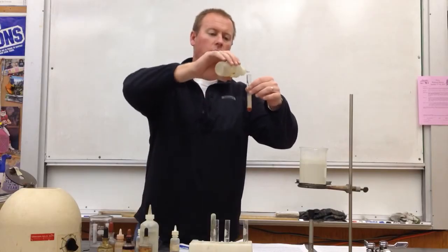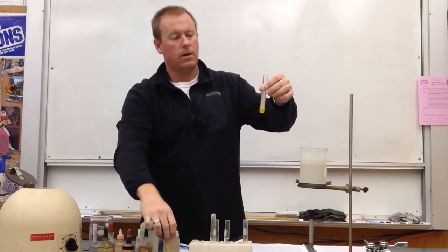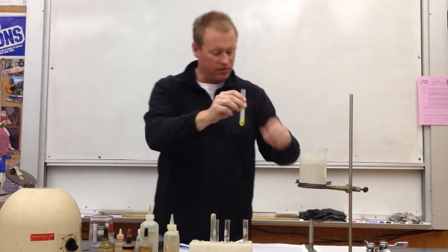Looks like it's going to take a few more drops. Three more drops there. Shake it up, stir it, whichever you prefer. And once I shake it and stir it and it's dissolved, I have this yellow-colored solution. So we're ready to continue on in step seven.